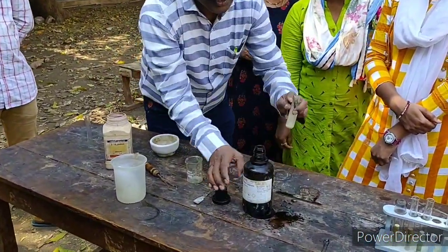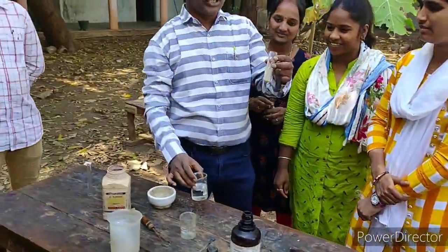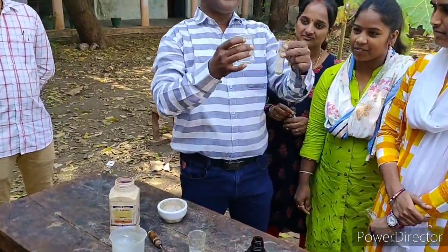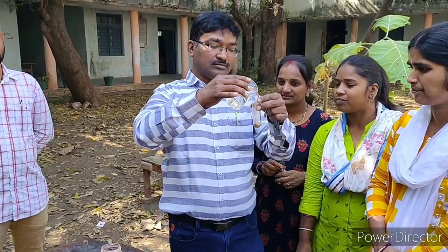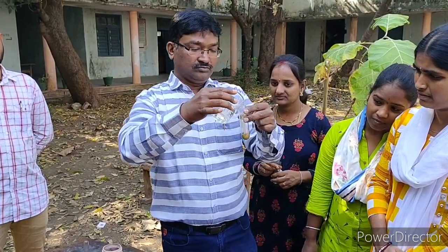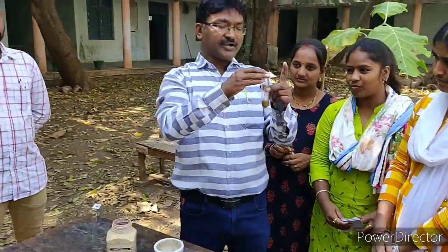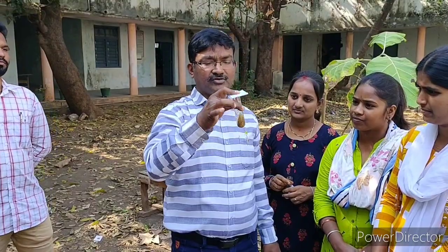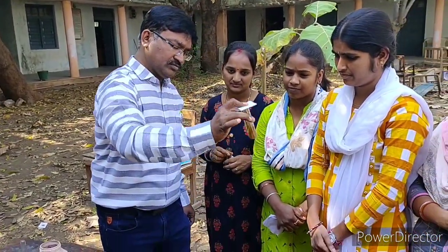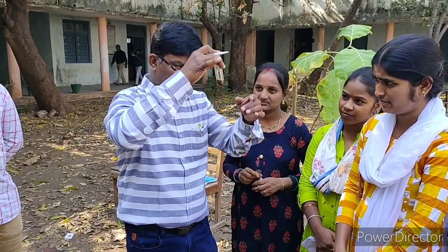After that we have to take the NaOH solution and add it to the beta-naphthol. Then we have to close the boiling tube and shake it in order to dissolve it completely.